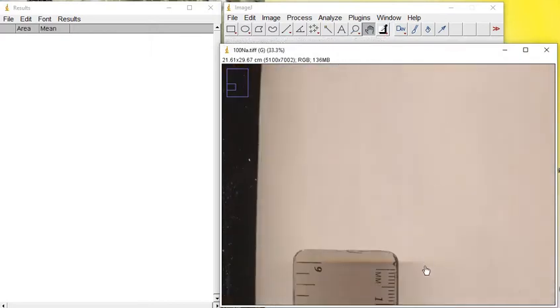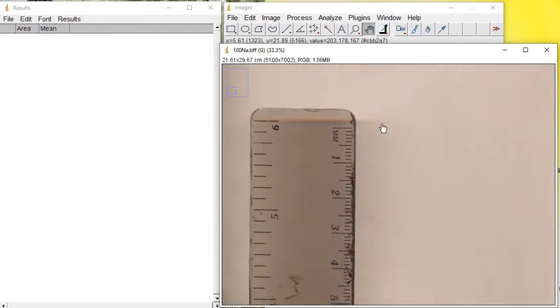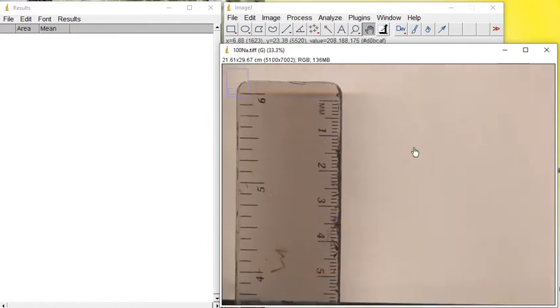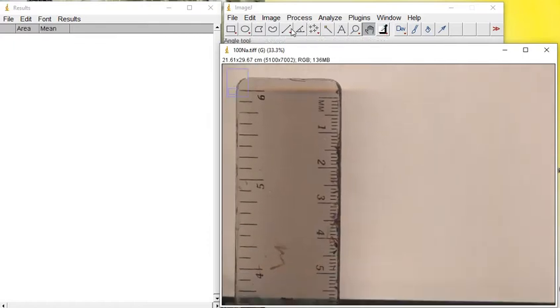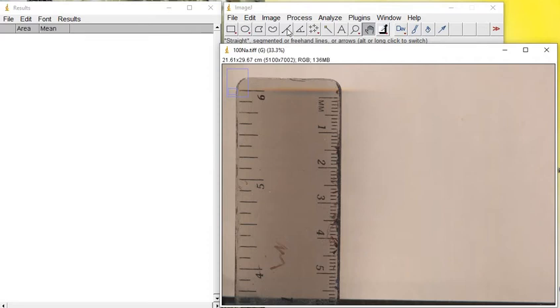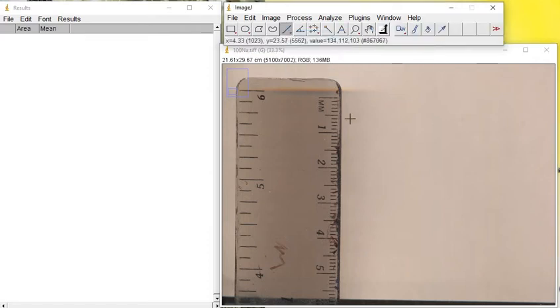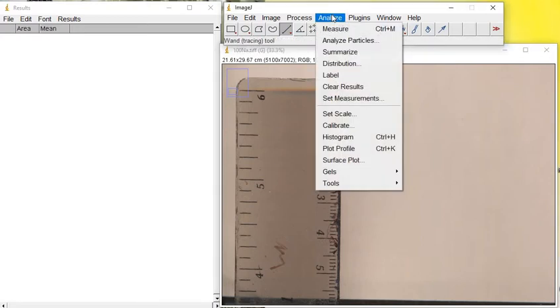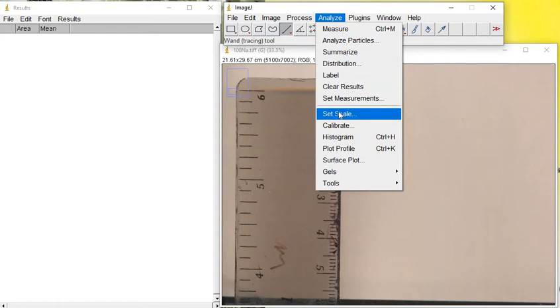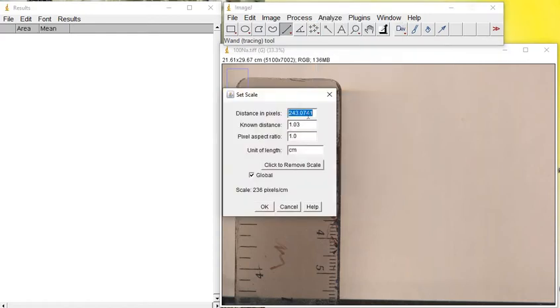As always, first we need to set the scale. Use this function in the tools. When you right-click, you can get the straight line, then draw a line and go to Analyze and then Set Scale.